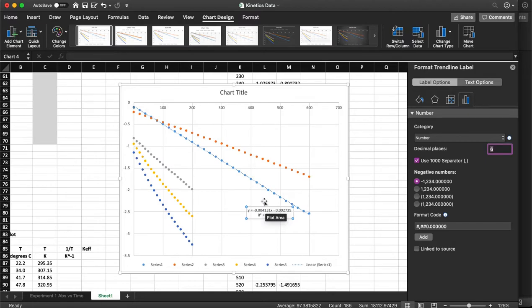So all first order reactions, if it's just the first order reaction we're looking at, which in this case we said it's first order for just the crystal violet, which is why we're calling it K effective and not just plain K. This is K effective, it's really the rate constant with respect to the crystal violet only. Which is why it's first order, as we've talked about. And so first order units on that rate constant are 1 over seconds.